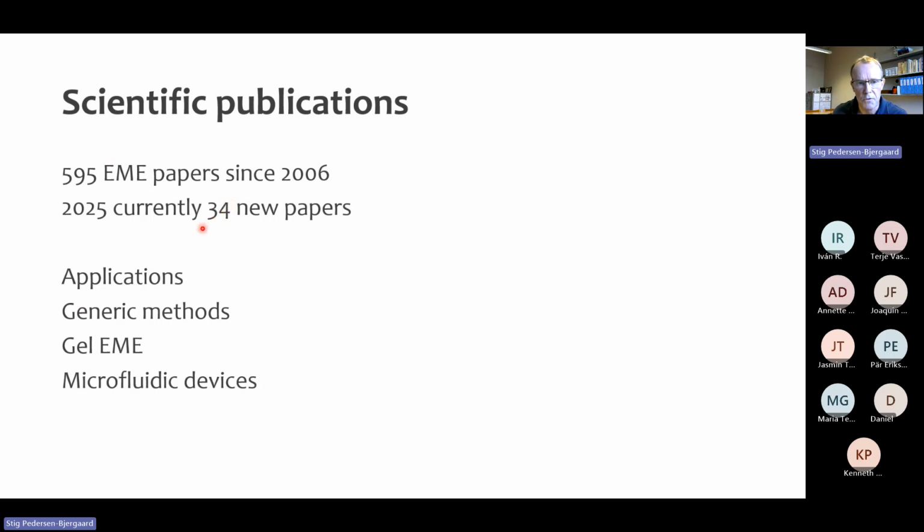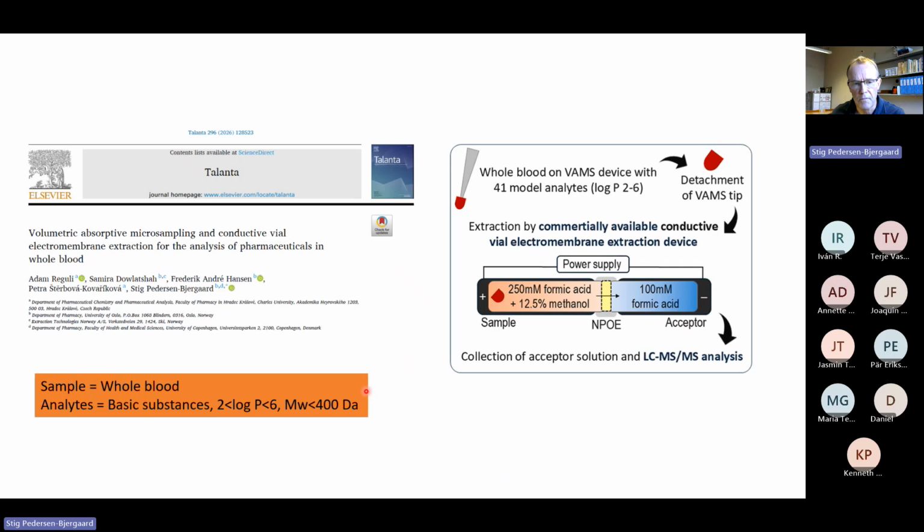And I would like to show you a few examples of how people develop applications, how they develop generic methods, how they do EME with aqueous gels rather than organic liquid membrane, and also how this EME principle is transferred into microfluidic devices and paper analytical devices. So this is just to give you a flavor of what is going on in the forefront of EME.